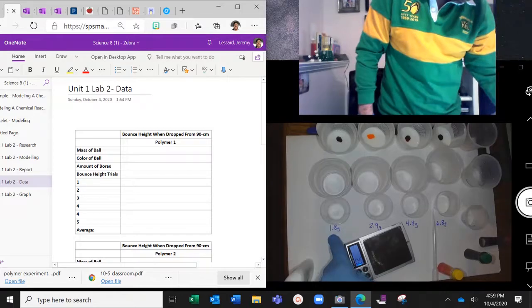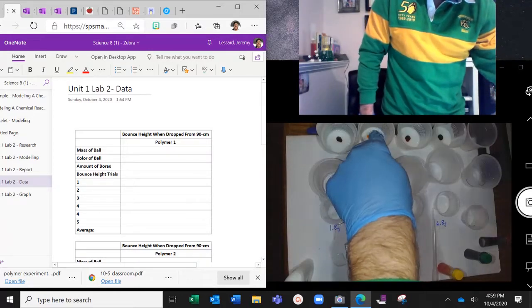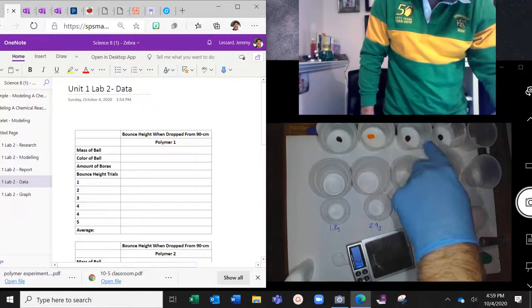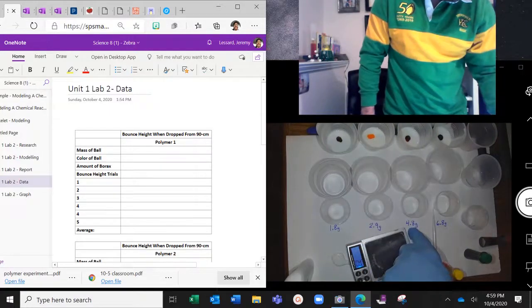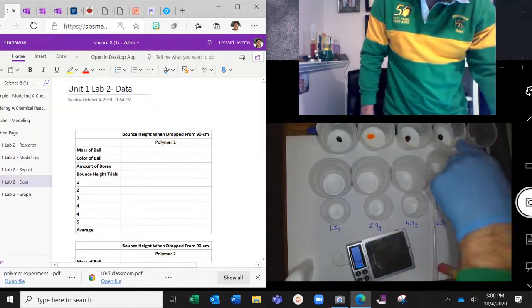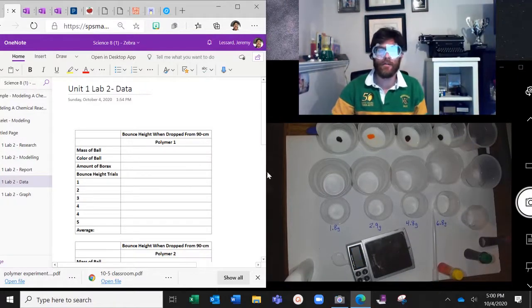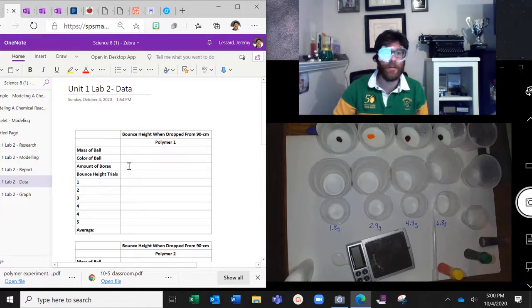Okay, and so we're going to have our red be 1.8 grams, our yellow be 2.9, our orange, which is 1 and 1, be 4.8 grams, and our green be 6.8 grams. Okay, so make sure we record that in our data tables, right, under amount of borax and the color of ball. We don't know the mass of the balls yet, all right, but we'll get there.